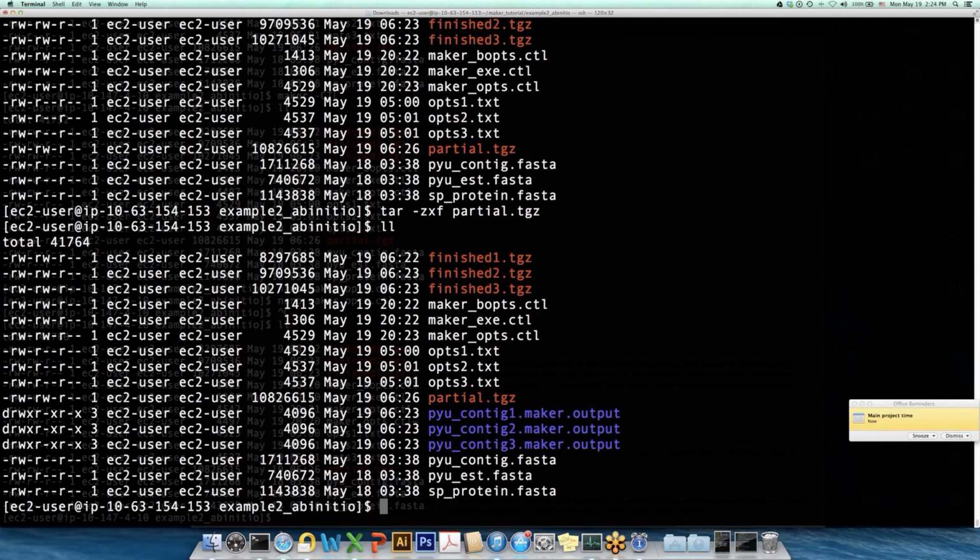Okay, so I was just showing you an example of how slow Maker was going to be on that config. It took about 40 seconds for it to go to about halfway through 100 KB of sequence processing, and there is about 2 megabases to go through. So we would be looking at about 20 minutes of processing, which we don't want to do.